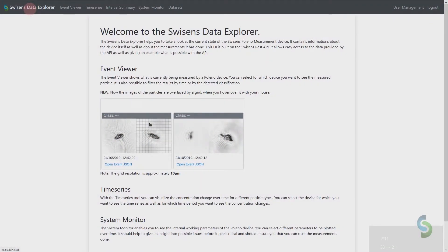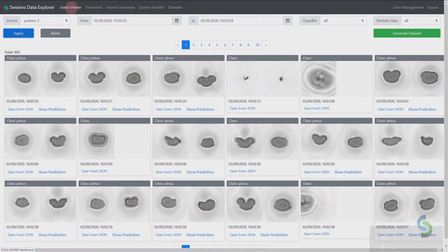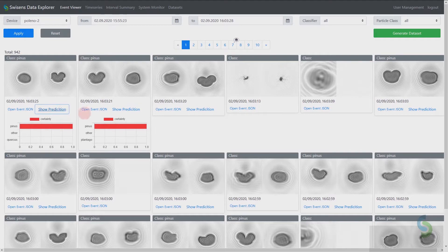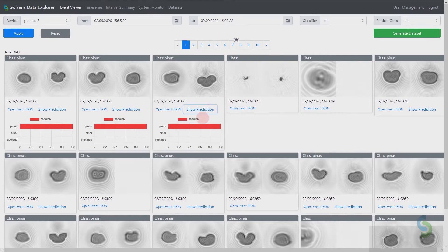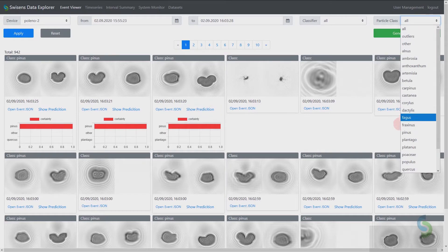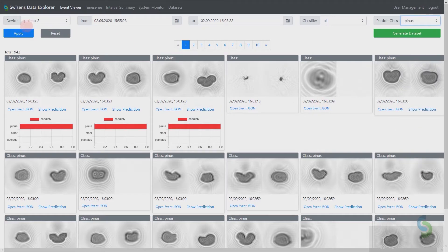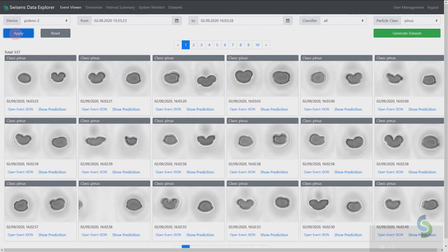Let's have a look into the particles measured with Swissence-Pollino. The image represents the reconstructed holographic image of the particle, and the classification tells us what kind of particle we measured. In this case our algorithm is already trained to Pinus pollen and identifies them correctly. Now we can easily filter out the particles classified as Pinus pollen to get rid of the other measured dust particles.